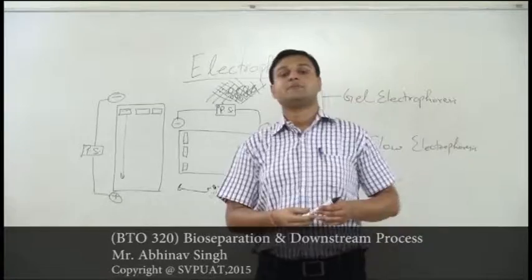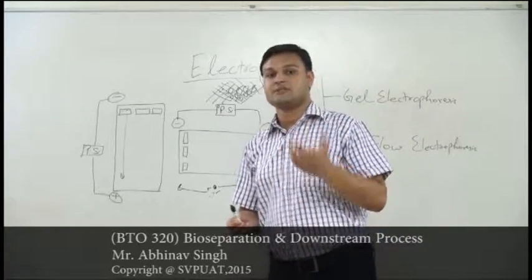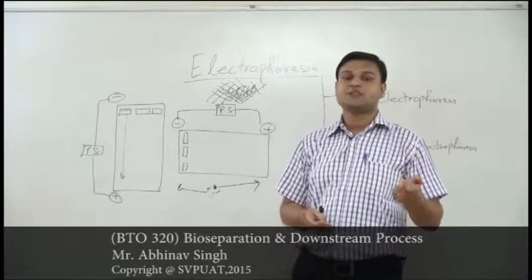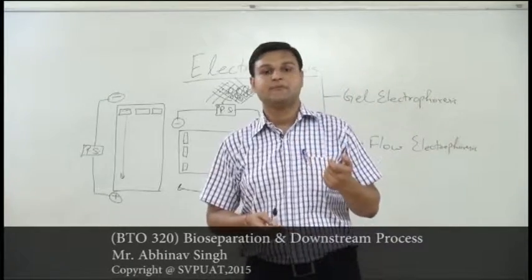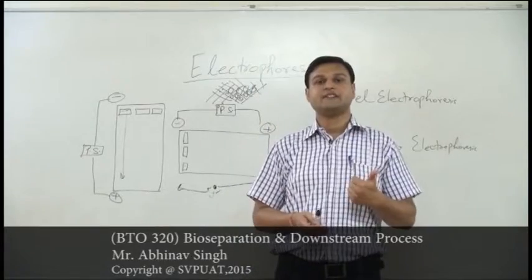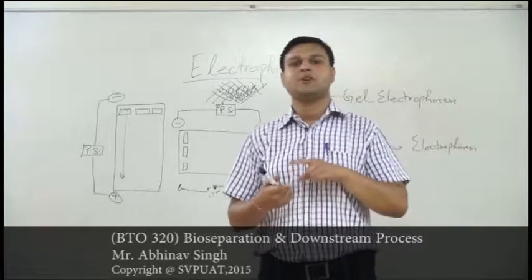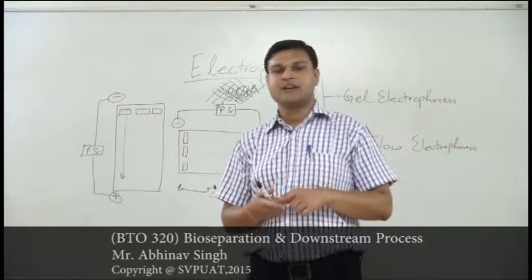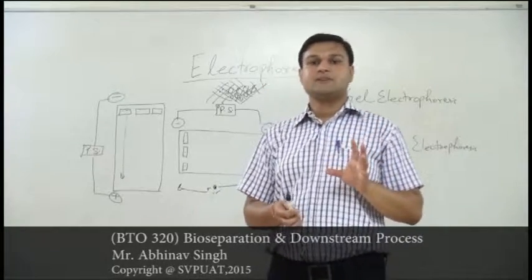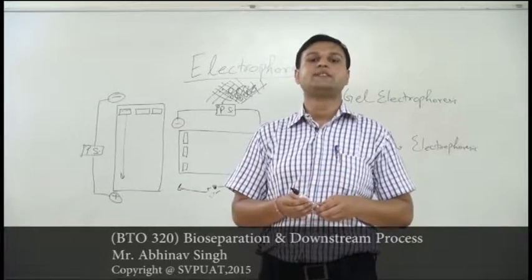But at times, when we are striving for a commercial product and that particular product is not required to be treated with chemicals like sodium dodecyl sulfate, at those instances we are directly going to use the native PAGE. What is native PAGE? Native PAGE simply means that we are going to directly use its intrinsic charge. Intrinsic charge means that we are not going to treat it with any kind of chemical, we are not going to alter its shape, its size, nothing. We directly use the protein as it is present in the system, we are not going to change its shape, neither are we going to modify its charge.